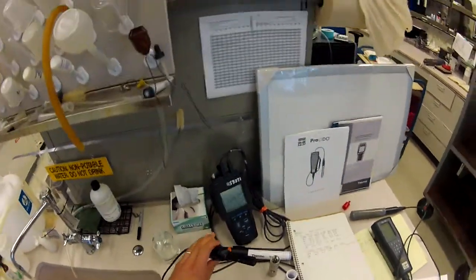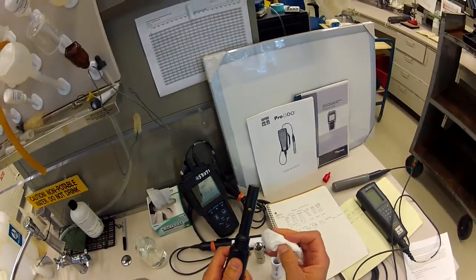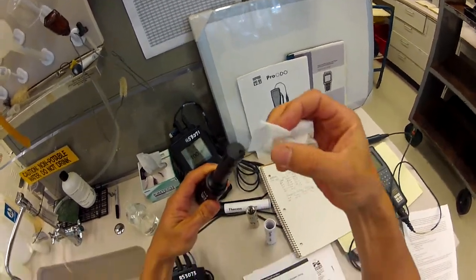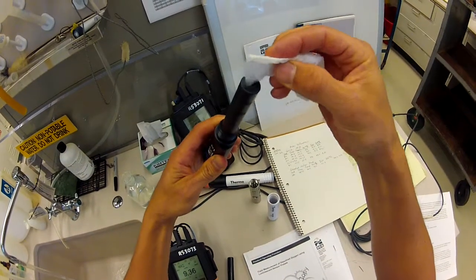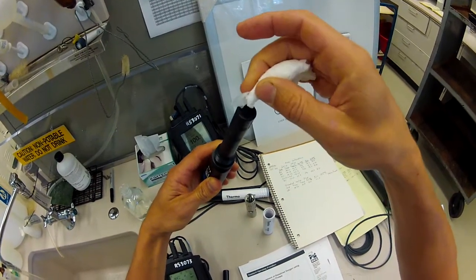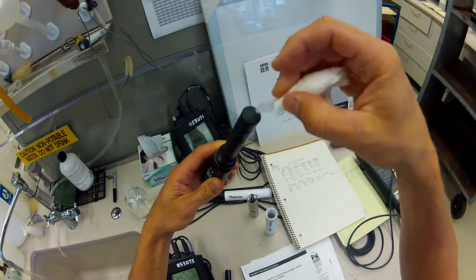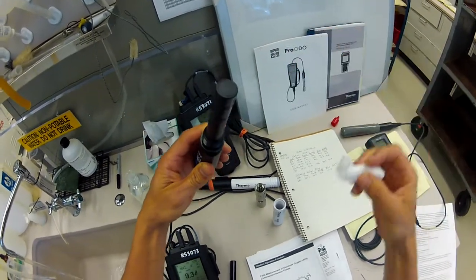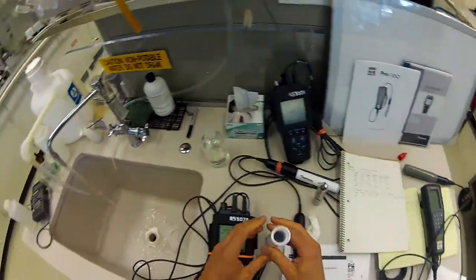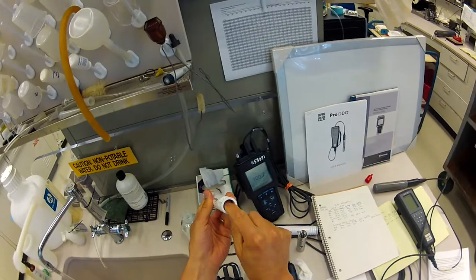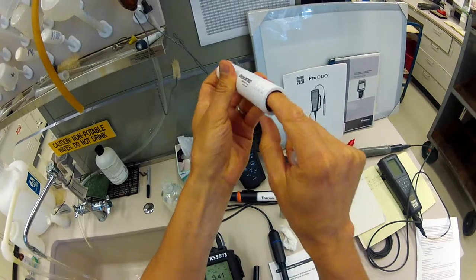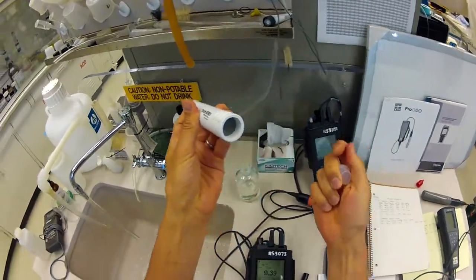So let's properly prepare our probe here. You've got your thermistor that you want to make sure is dry, and you also want to make sure that there are no water droplets on the business end of your sensor here, on the sensor cap. And you want to be gentle with how you dry this off. You don't want to just scratch away at it - I'm just using the tissue there to get the water off.